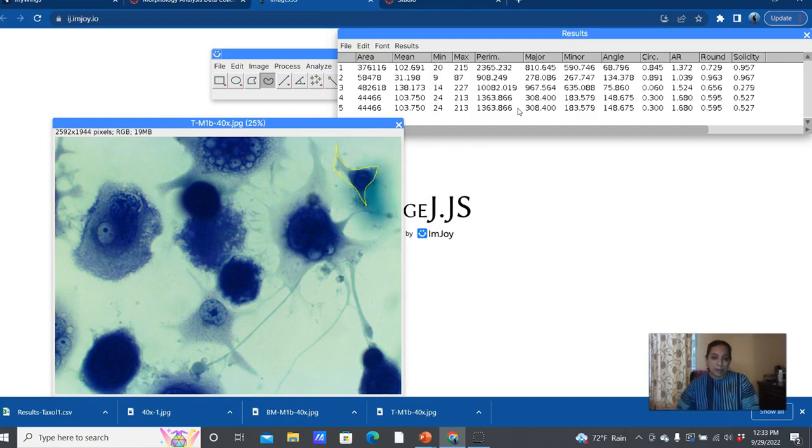You didn't get to experience microscopy quite the same way as you wanted to, which we still will get to do. We have other labs that are going to utilize microscopes as well, but at least you can get more comfortable with ImageJ and explore some of those higher-level functions when you look at those interesting observations.